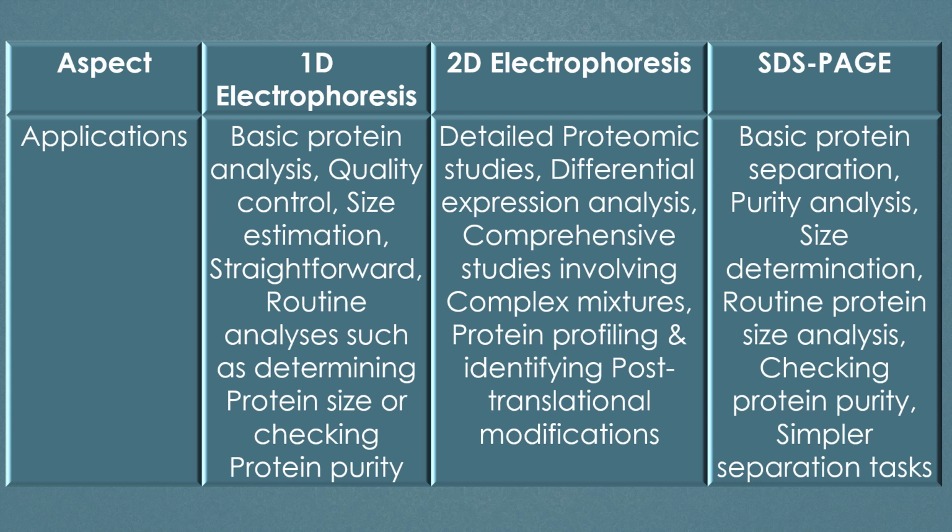post-translational modifications. SDS-PAGE is very useful for basic protein separation, purity analysis, size determination, routine protein size analysis, checking protein purity, and simpler separation tasks.